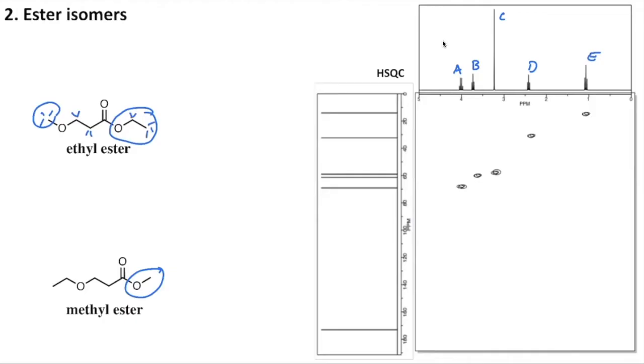So all of these little tick marks are identical within themselves, but they're different from all of the ones across, right? So there's no big plane of symmetry within this molecule. All of the hydrogens are next to some of these other groups. So let's get rid of all of those confusing annotations so that we can start again on a clean, fresh molecule. Okay, so we have A, B, C, D, E.